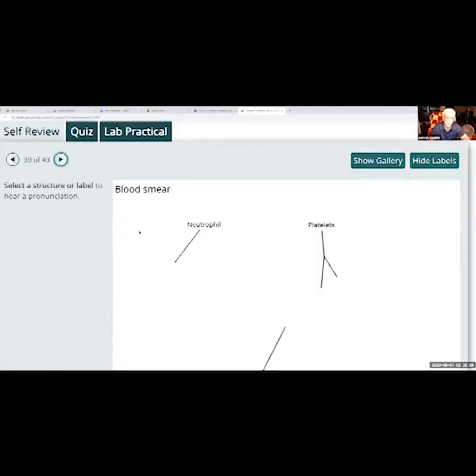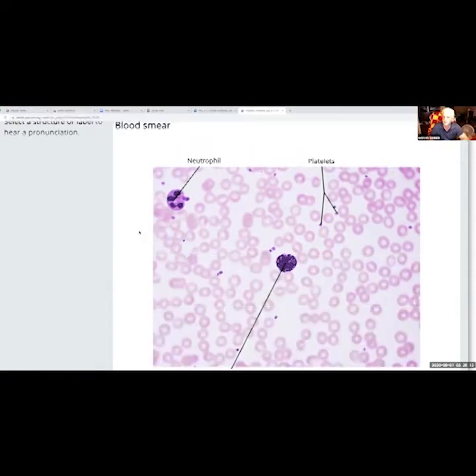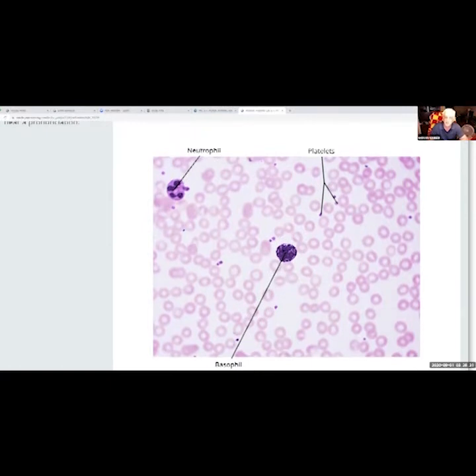More blood smears, and we'll take a look at them. Again, look at the red. Everybody can see the red blood cells, right? Things going to lag a little bit. Let it catch up. All right. White blood cells are very easy. They got nuclei in them. Red blood cells, no nuclei.